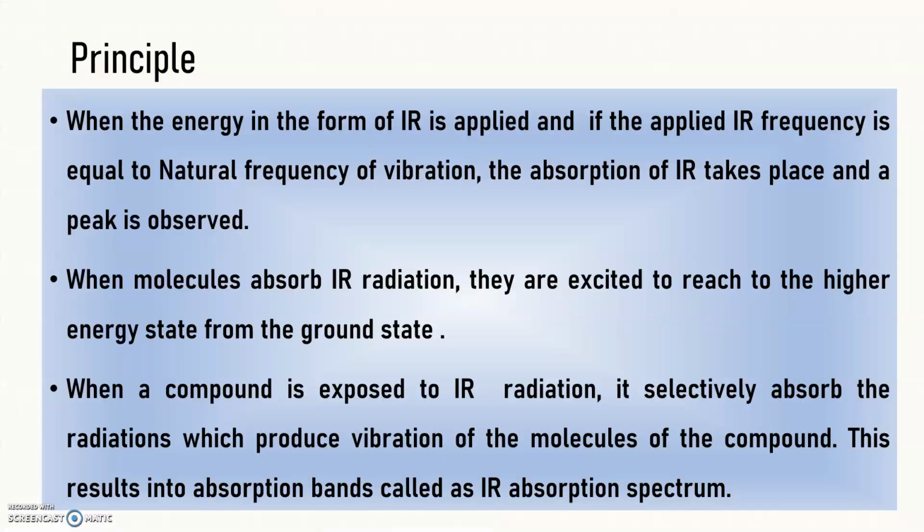Principle: when the energy in the form of IR is applied and if the applied IR frequency is equal to the natural frequency of vibration, the absorption of IR takes place and a peak is observed. When molecules absorb IR radiation, they are excited to reach the higher energy state from the ground state.